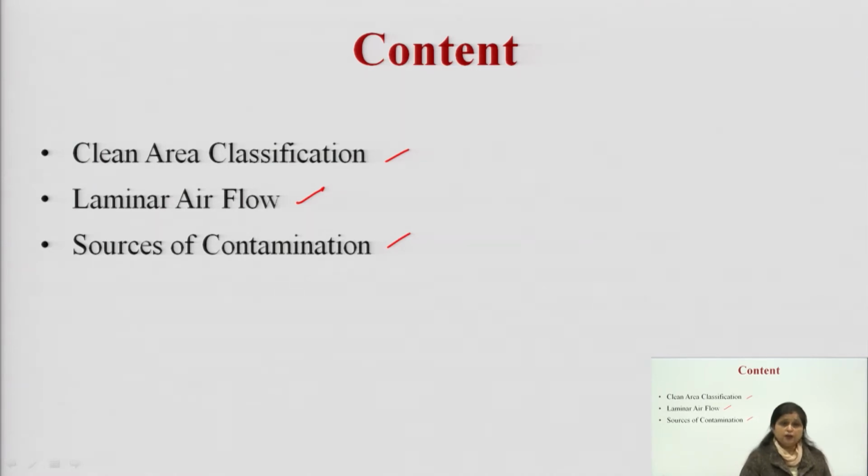Whereas in case of oral preparations, which are given through the mouth, we can prepare them in normal labs. But when we are dealing with parenteral products, we have to take extra precautions so that there is no contamination within those products. So now, how has the clean area been classified based on various guidelines? That we will discuss.